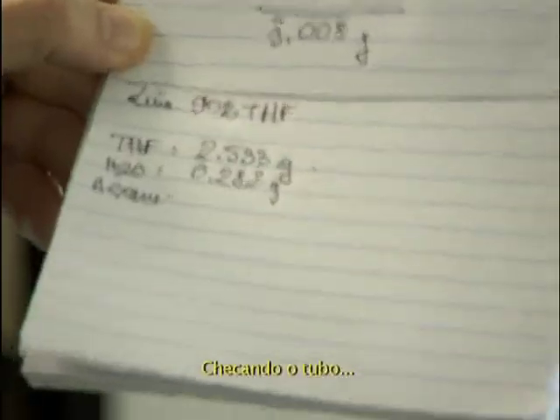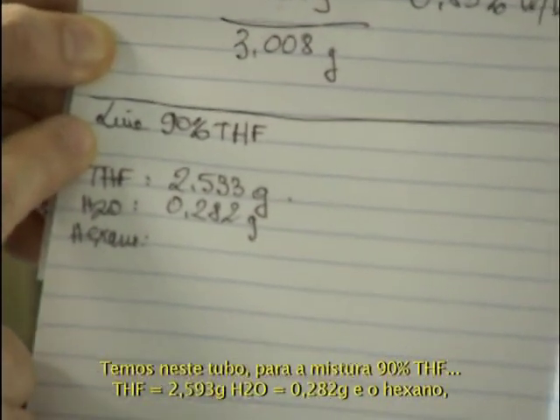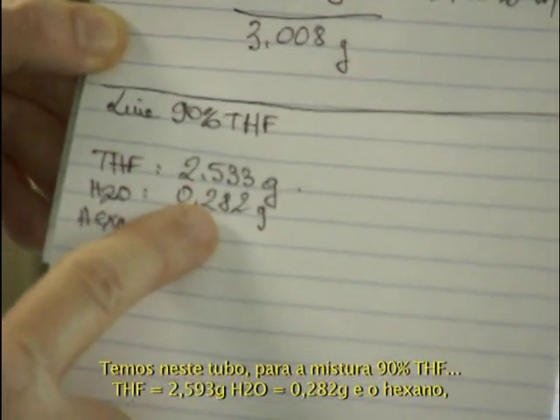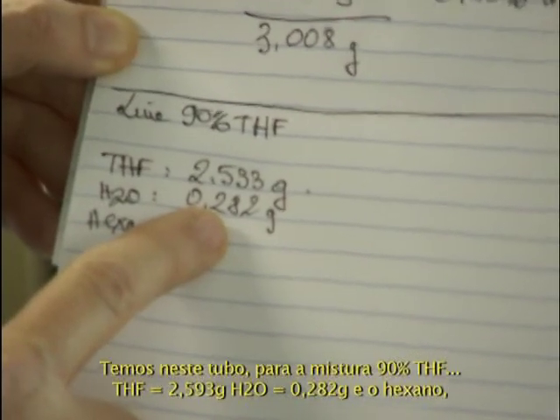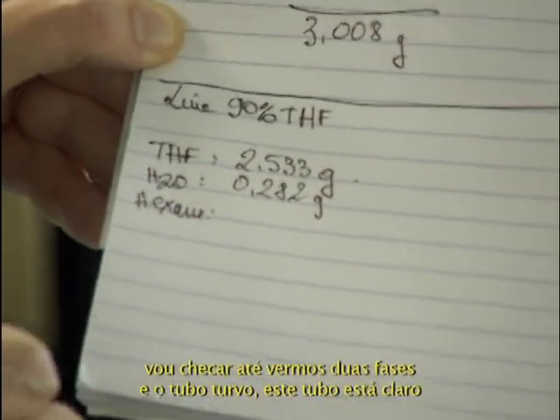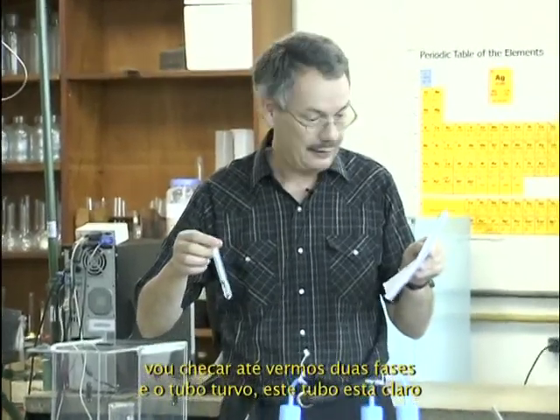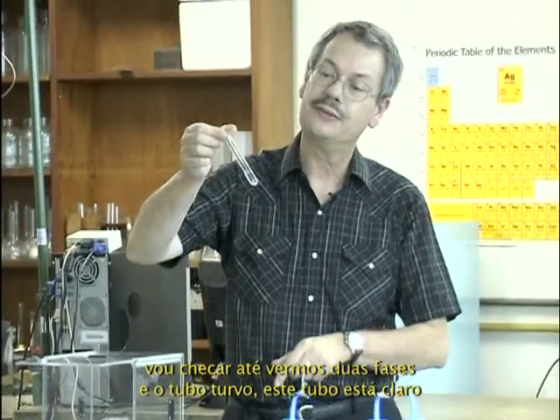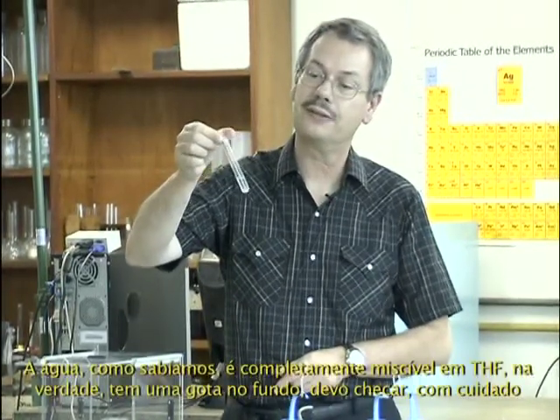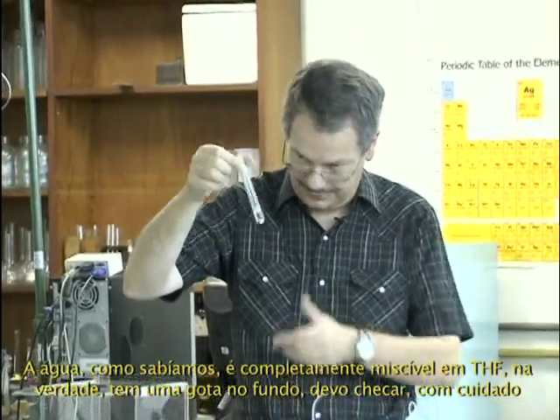Checking the tube. Okay. We have in this tube for the line 90% THF: THF 2.593 gram, water 0.282 gram, and hexane I will add until seeing two phases or a cloudy tube. This tube is clear. So water, we knew it, is completely miscible in THF.